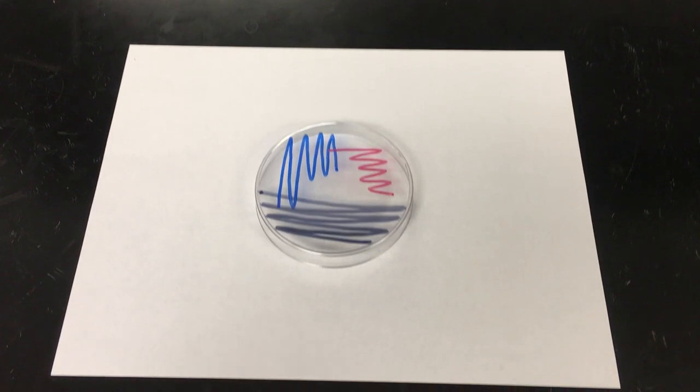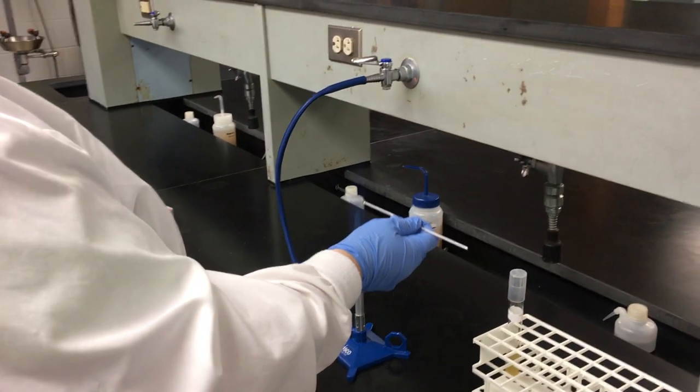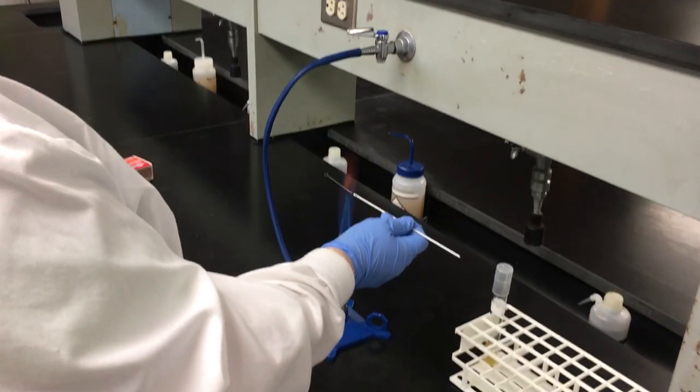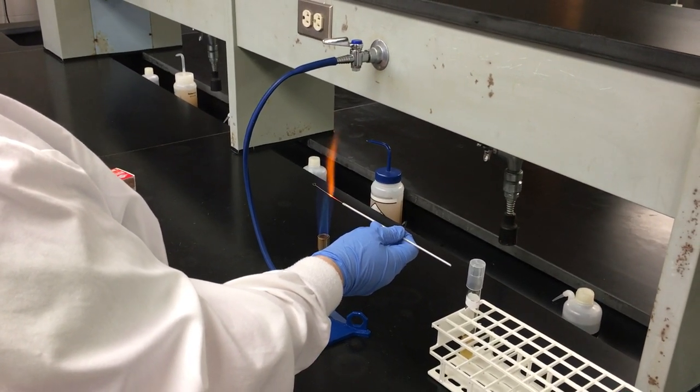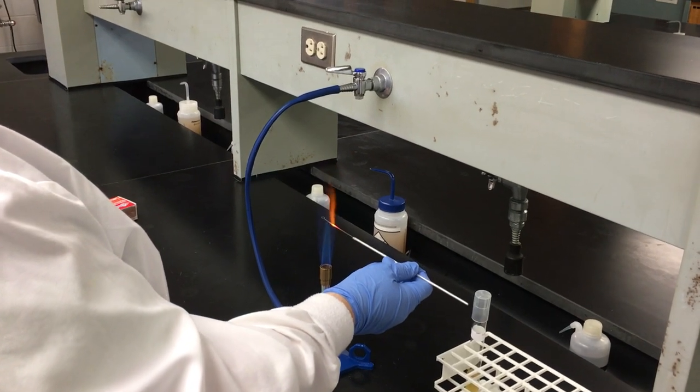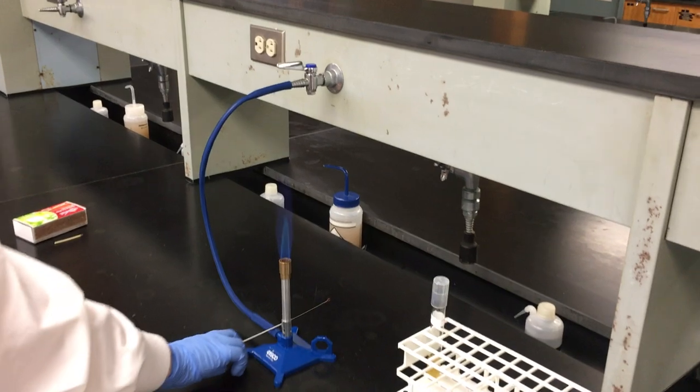This is what step three should look like. Your last step will be then sterilizing your loop from handle till tip to prevent the spread of organism anywhere on your lab bench. And that is pure culture.